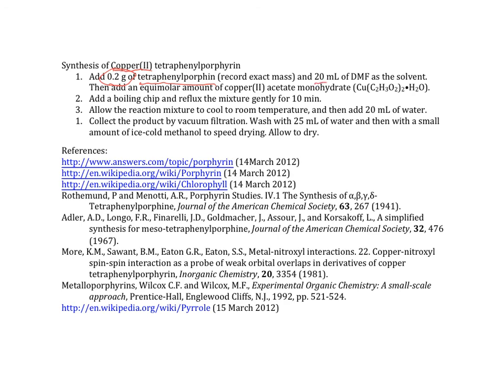We're going to use dimethylformamide as our solvent. However many grams of this, you need the same number of moles of copper 2 acetate monohydrate. So again, you've got some grams to moles calculations that you're going to have to do at the time. If you've got less than 0.2 grams, you'll have one amount, right? So however much of this you weigh will determine how much of the copper 2 acetate you use.